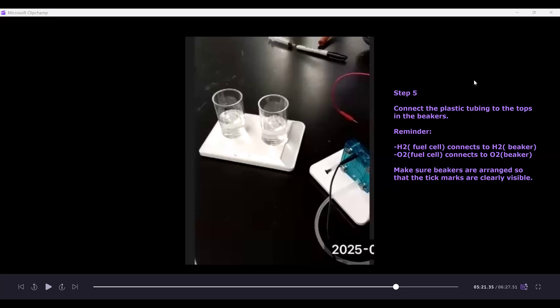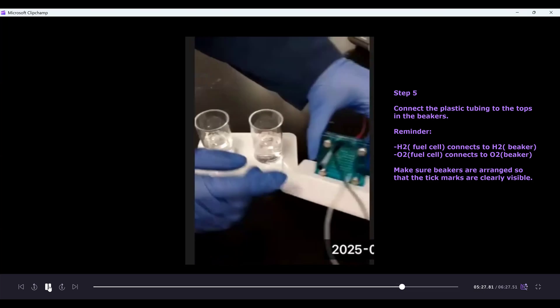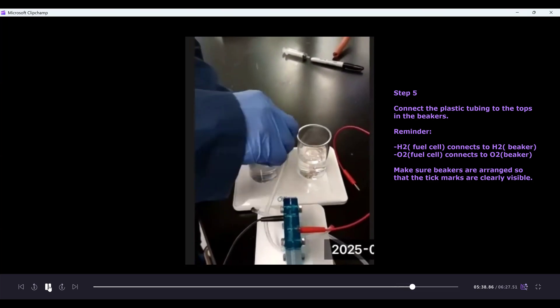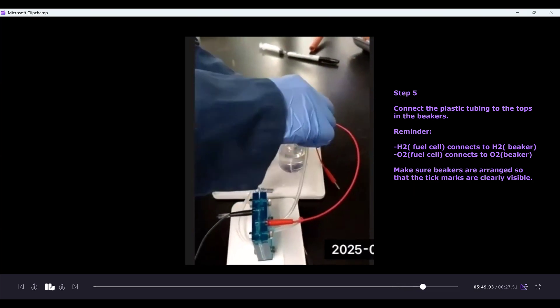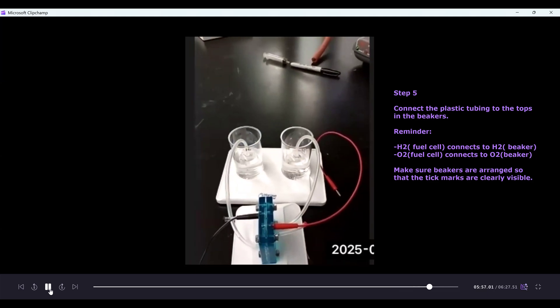Step five, the last assembly step: connect the plastic tubing from the fuel cell to each plastic beaker. The hydrogen side of the fuel cell connects to the beaker labeled H2, and the oxygen side connects to the beaker labeled O2. Take the longer hose on the H2 side and connect it to the beaker labeled H2, and the longer hose on the oxygen side connects to the top of the beaker labeled O2. Make sure the beakers are arranged so you can clearly see the tick marks.